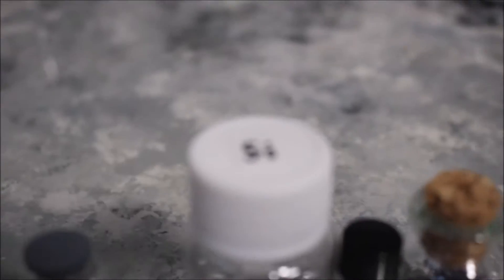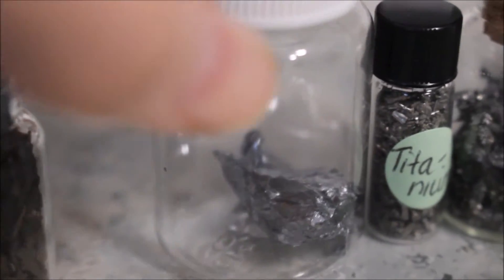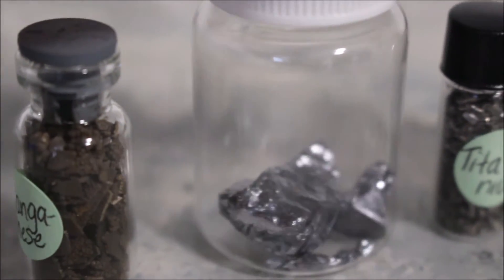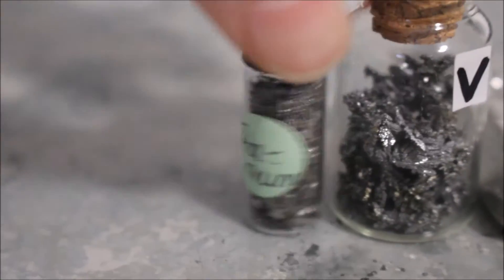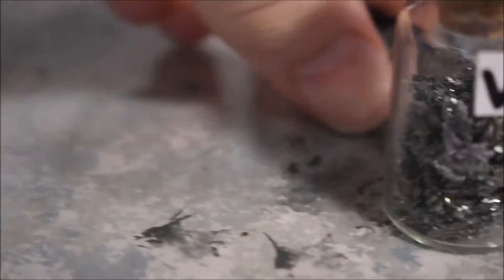Next is elemental silicon. This is really cool — there it is. I take it out of the container sometimes. Next, titanium pieces — little pieces, and these are all pure samples. Titanium is a transition metal, as are a few of these. Super pretty and lightweight — barely feels like I'm picking up anything.